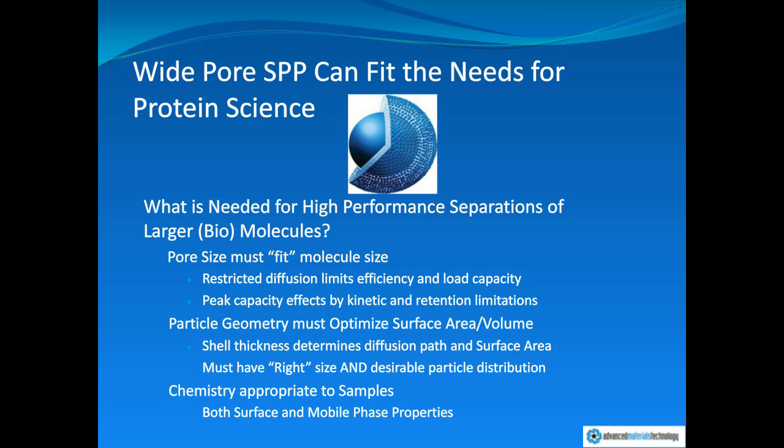So wide pore, superficially porous particles were originally conceived, and again, this goes back pushing 25 years now, for the needs of bioanalytical science. And even though we found that superficially porous particles are quite useful for fast separations, for high efficiency separations of smaller molecules, where we really believe they shine is in the separation of larger molecules, and in particular those of bioanalytical interest in protein science.